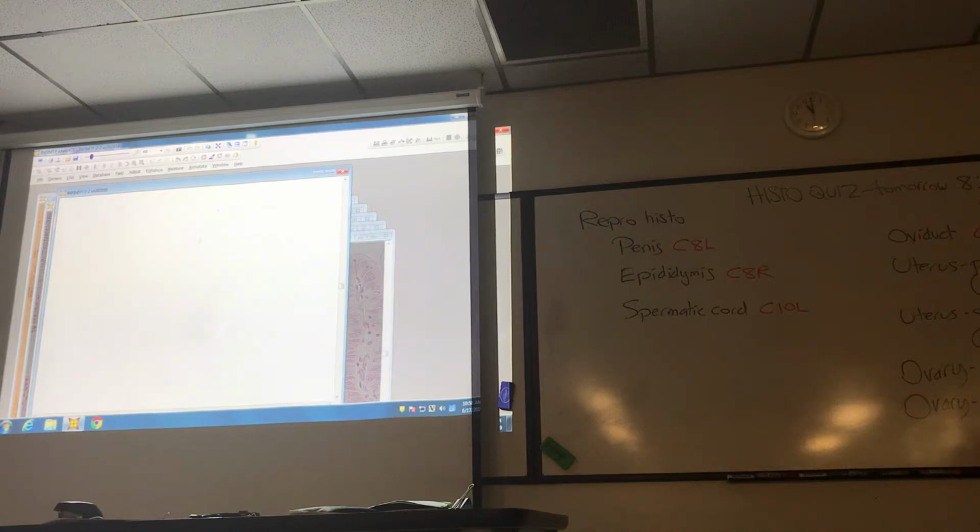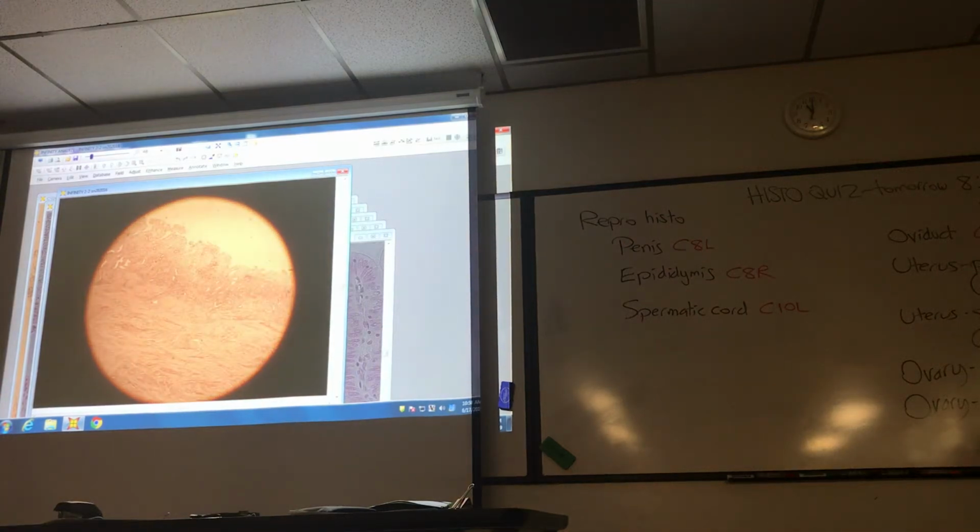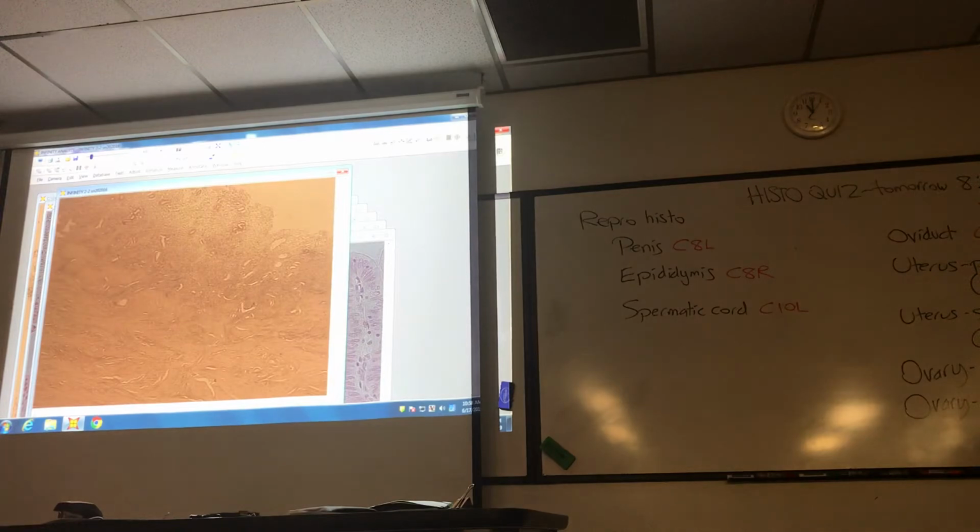Now the uterus is, well, it depends what cycle. Now, this one's going to be the first, roughly the first 2 weeks, the follicular phase. The ovaries in the follicular phase, and the uterus is in the proliferative phase. Go with 40x.